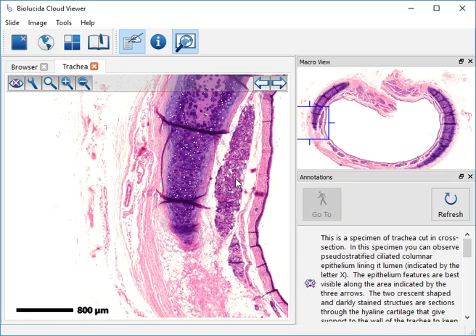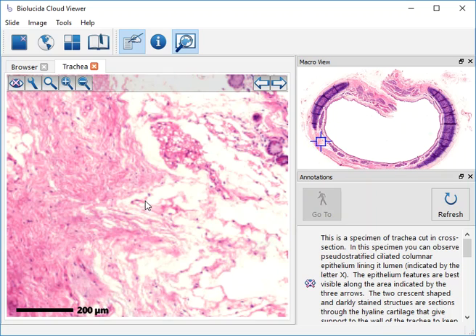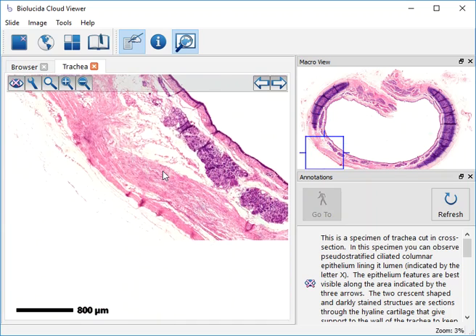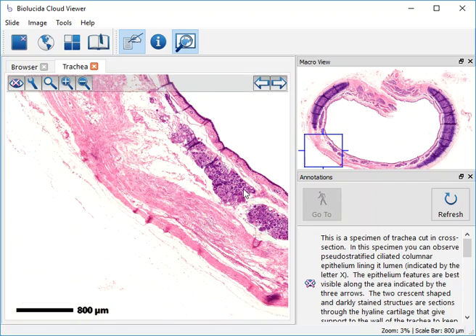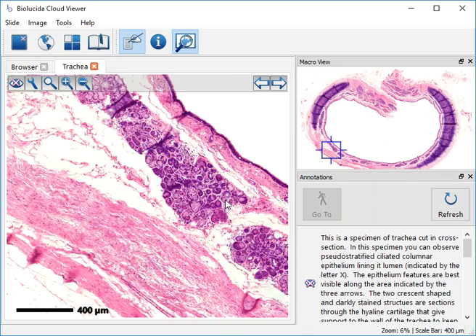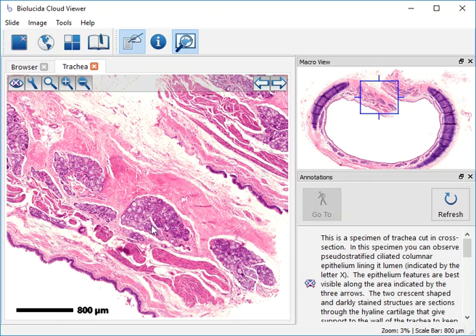So I think, again, you should explore this, practice recognizing loose connective tissue, more dense connective tissue, glandular epithelium, mucous and serous, and the lining epithelium. Over in this area, there are more glands also. So that constitutes a little review of that particular specimen.